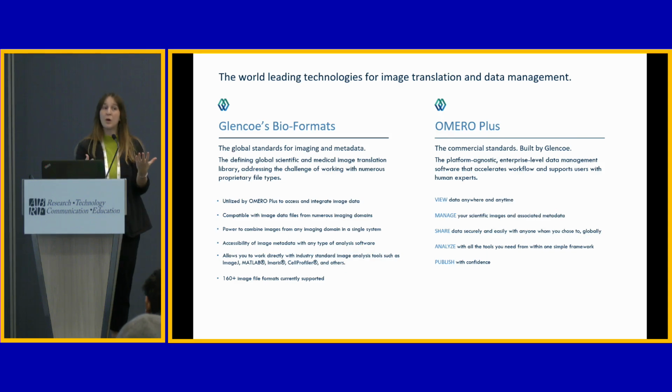This is constantly growing, so some of the work that Glencoe Software does is that we develop new readers for formats that our customers care about, and almost all of that work is contributed back to the open source. There are exceptions, but really only when something is maybe something we don't fully understand yet. We have some small set of examples of that file format, and it's not really yet supportable in the open source community, but we try to have all of that development go back into the open source because we really consider Bio-Formats as kind of a standard of how we work with imaging data, and so it doesn't really benefit us to keep that code private to Glencoe Software.